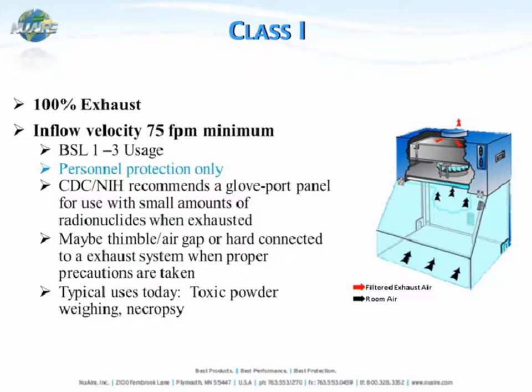The Class I is only providing personnel and environmental protection — it is not providing any product protection in the work zone. The airflow can be recirculated back into the room space, or exhausted to the outside via a simple exhaust transition or a hard connection to the exhaust system.